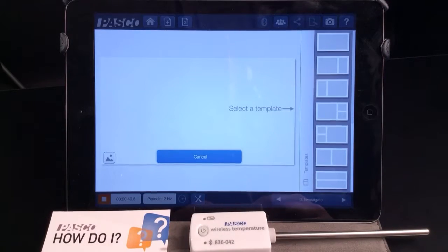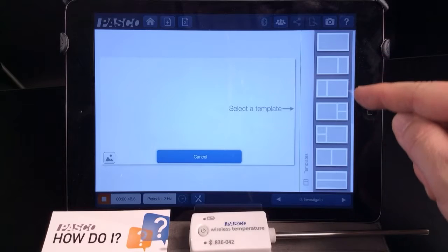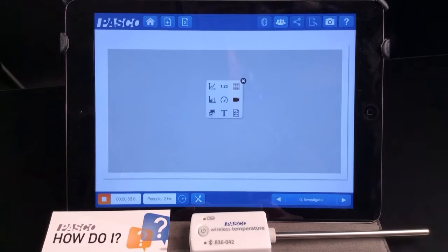I was on page 6, I will now be creating a page to follow it, a new page 7, and I have a choice of templates or layouts along the right side. I simply want a full page graph, so I'll choose one large item at the top of this list. It will create for me this new page 7 inserted between page 6 and the previous page 7.